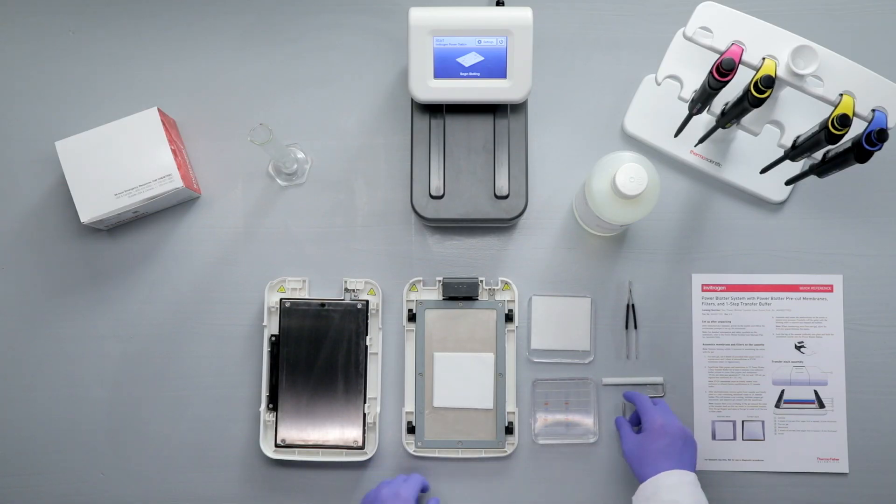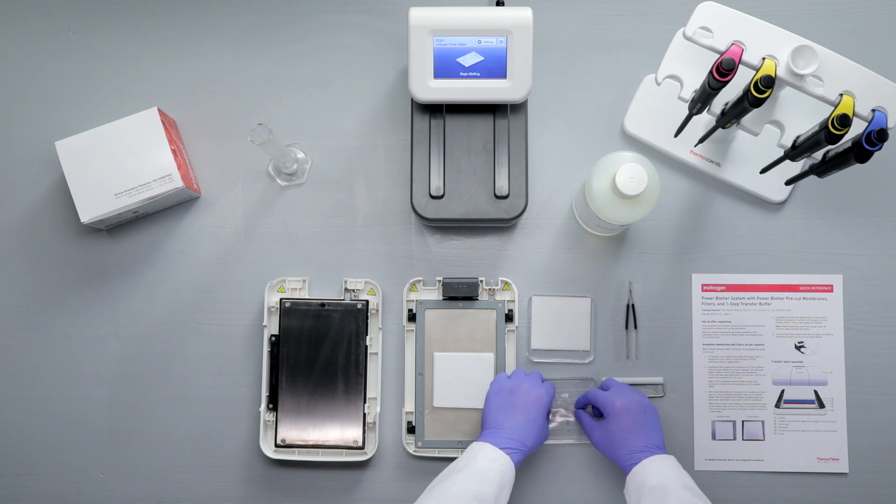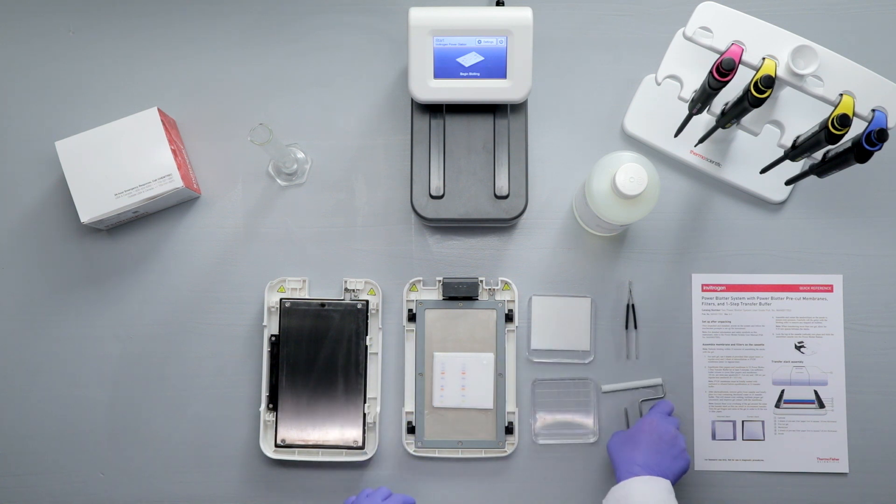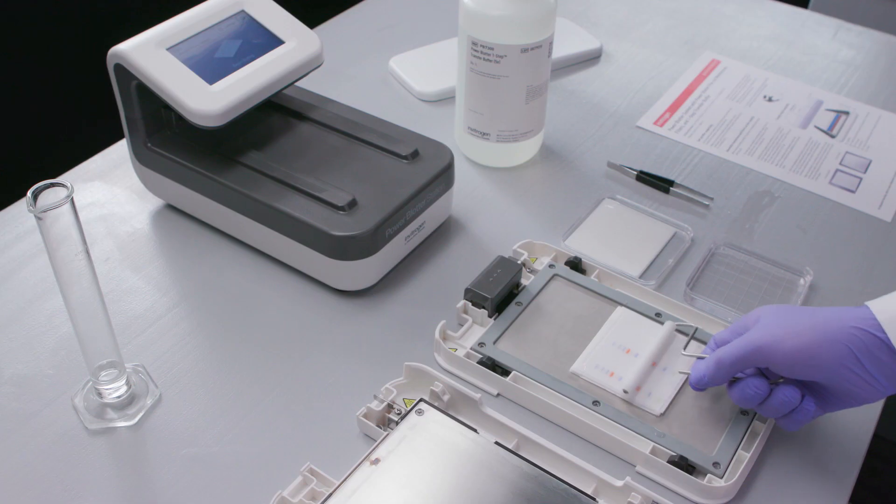Immerse the pre-run gel in deionized water for 5 to 15 seconds. Place the pre-run gel on the transfer membrane. Trim the gel carefully so that no parts of the gel overhang the sides of the stack. Use the roller to remove any air bubbles from between the gel and the membrane.